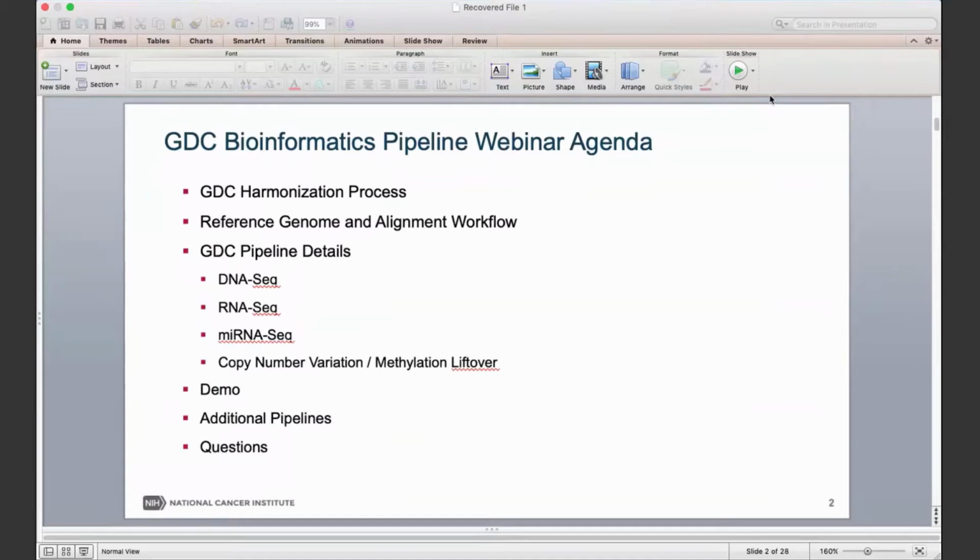So for today's webinar, I've got it up here on the screen. We're going to talk about the GDC harmonization process, reference genome, alignment workflow, and then the meat of the presentation is going to be actually diving into the pipelines themselves and talking about how we process the data at the GDC. So we've got the DNA-Seq pipeline, RNA-Seq, miRNA-Seq, and then copy number variation and methylation liftover pipelines. And then at the end of that, I'll just jump into a really brief demo showing where to find the data on the GDC.